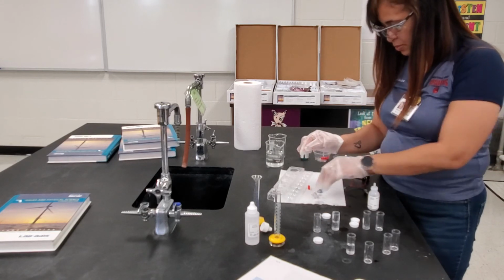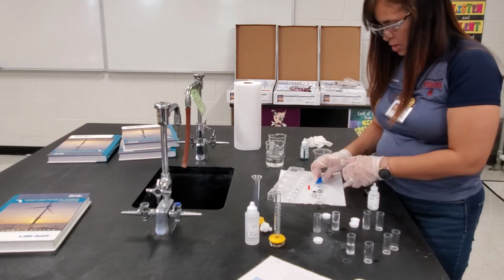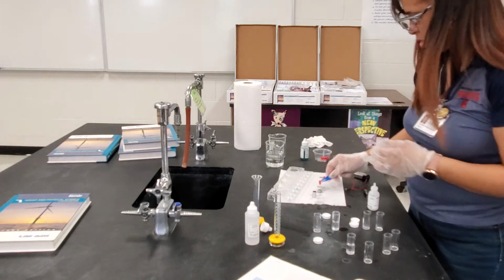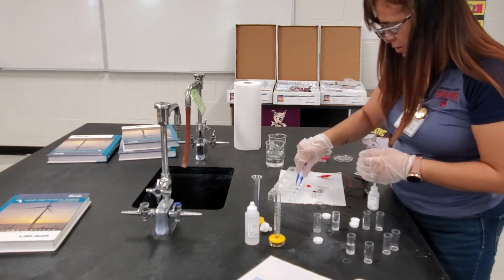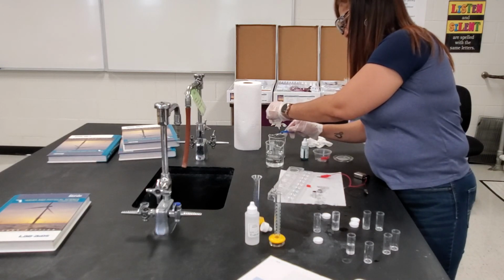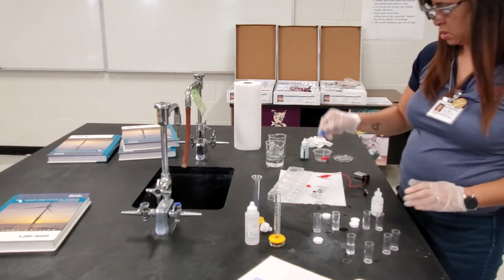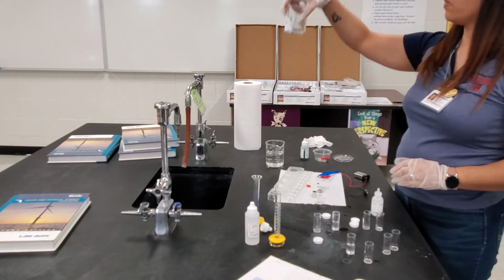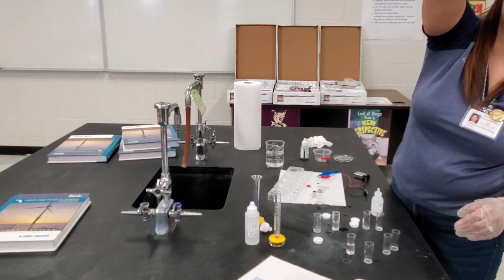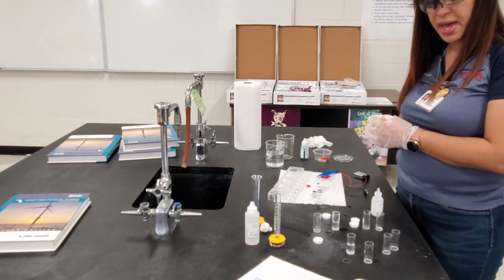The red cylinder, there was no change to the cylinder at all. It looks exactly the same. And the black cylinder, or the black square, excuse me, had no change at all. In fact, looking at my wastewater, there is a brown substance sitting in the water that came off of the very first one. So I hope that helps.